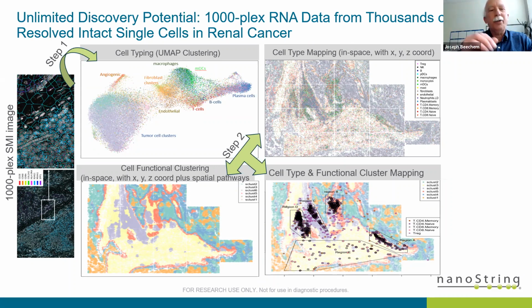You see these all over the place in tissue, and the same thing happens here at the single cell level. You get regions where two different cell types meet along a boundary, and then you get unique gene expression linked uniquely to that boundary. And sometimes there are gene expression patterns that span a wide spatial domain.